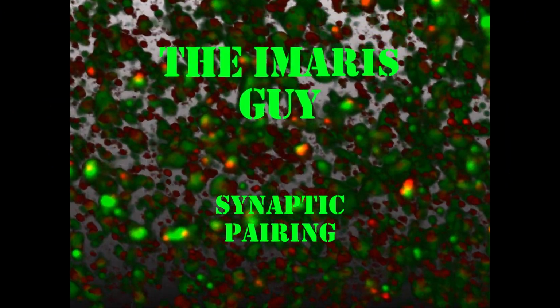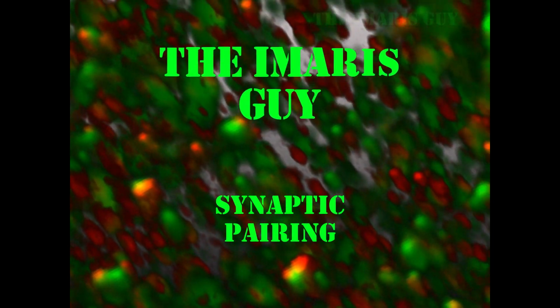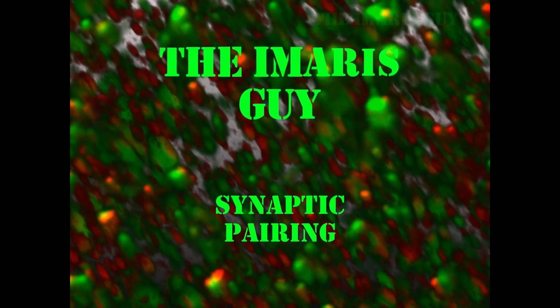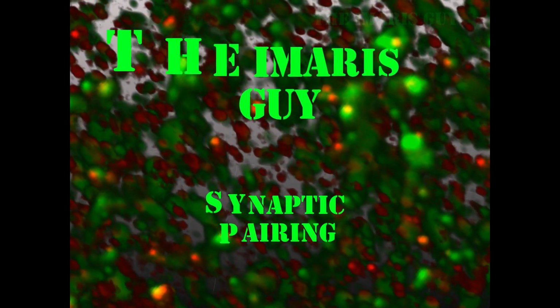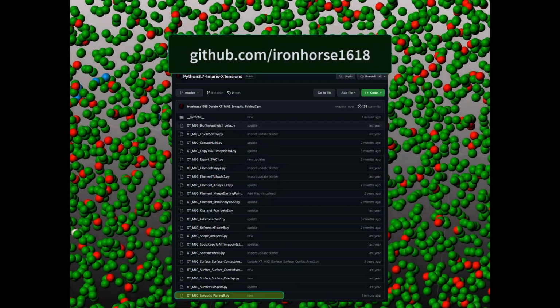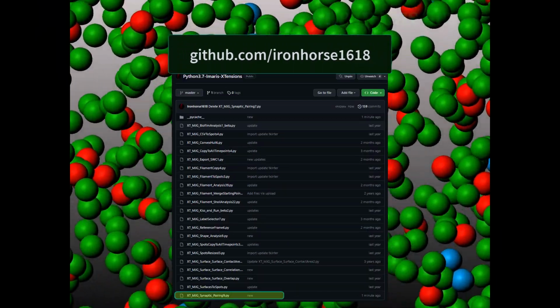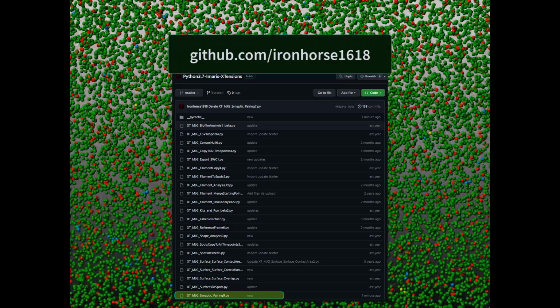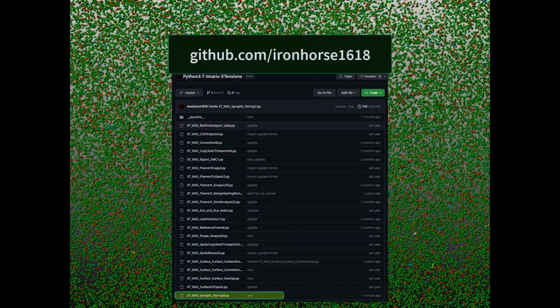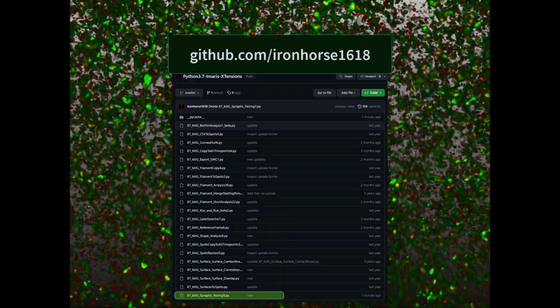In this video we're going to cover the extension called synaptic pairing. Mainly this extension is going to be used to further the advancement of the colocalization of two sets of spots within a 3D volume. As with all of my extensions, these can be found on my GitHub page shown here. This particular one is version 9, Synaptic Pairing 9, the one that we're going to go over today.